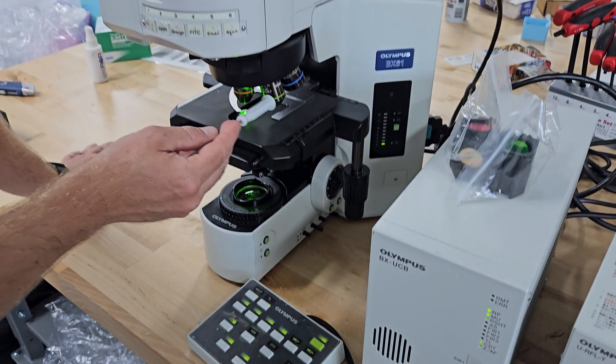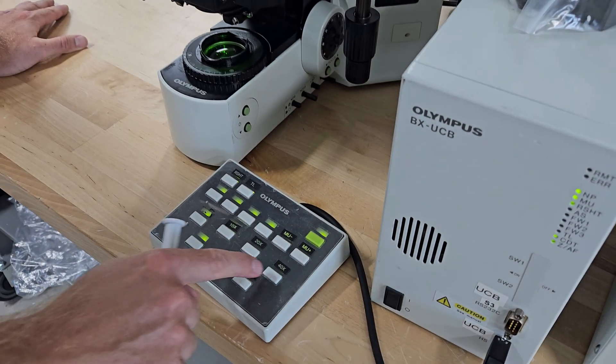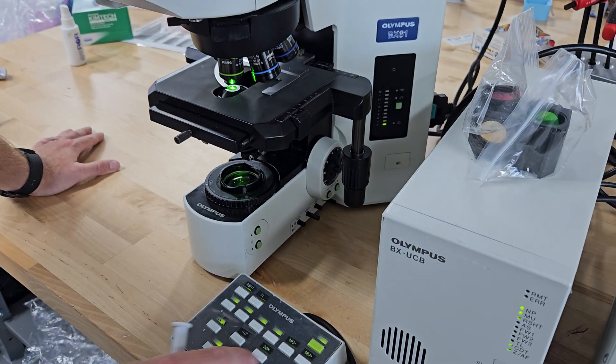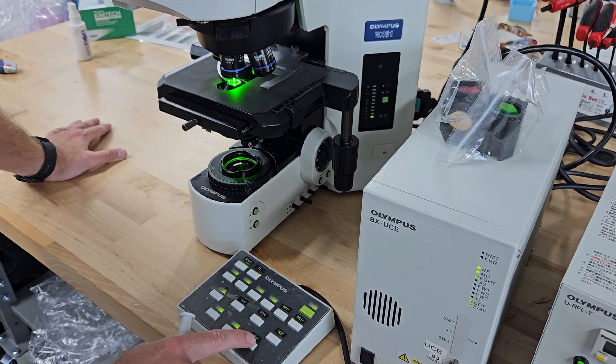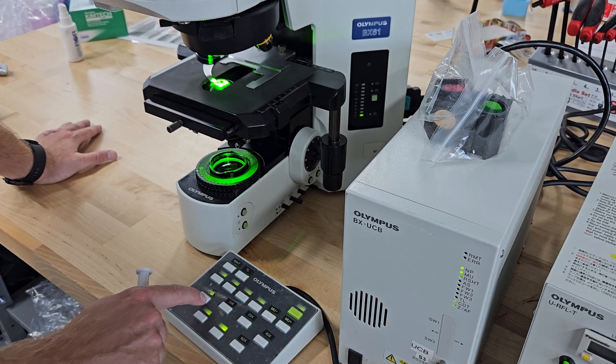They wanted four objectives on this system, so we marked them. They wanted a 10, a 20, a 40, and a 60. The 10 is in — if you want to change to the 20, hit that button; the 40, hit that button; the 60, hit that button. If you want to add objectives, you can keep going and then label them.